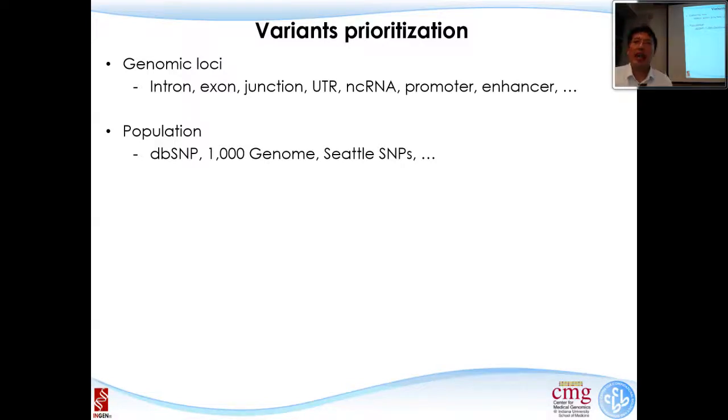So one important step people do is look at whether we have seen the variant in dbSNP or in the 1000 Genomes Project. Because those are healthy individuals, if it's a specific phenotype that you're looking at, it shouldn't happen a lot in the general population. Sometimes we want it to be less than 5%, or sometimes even 1%, allele frequency in the general population, and we check whether it's in other databases as well. Those are the levels of information that we want to use.